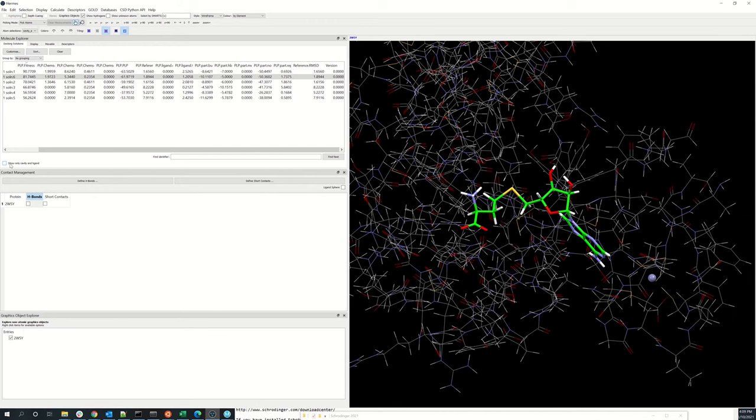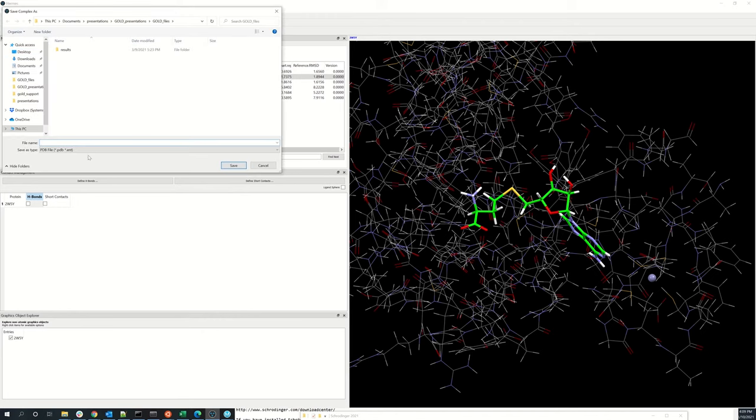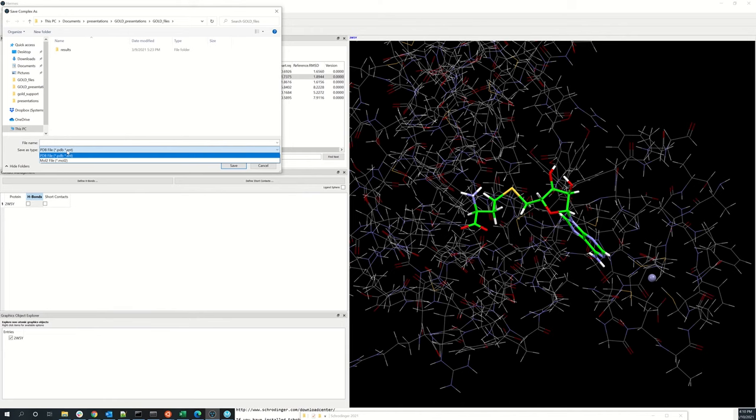If you want to save your complex, you can go to file export complex, and you can save the complex that you have on the screen at the moment either in the PDB or the Mol2 format.